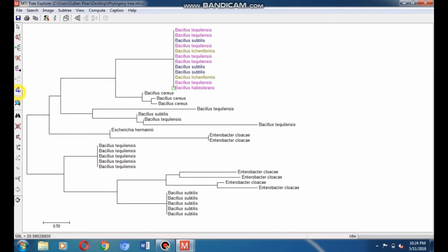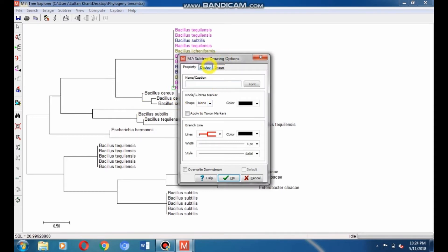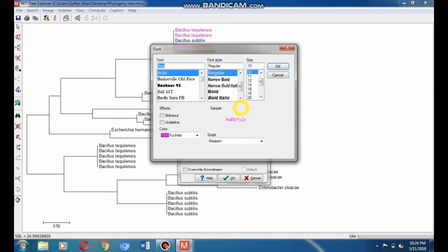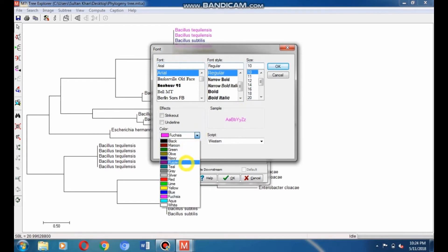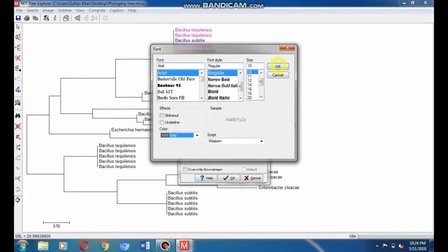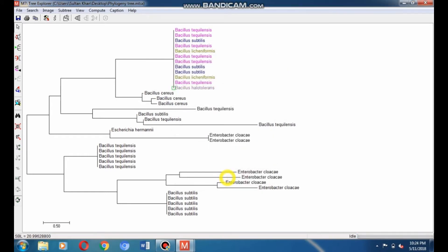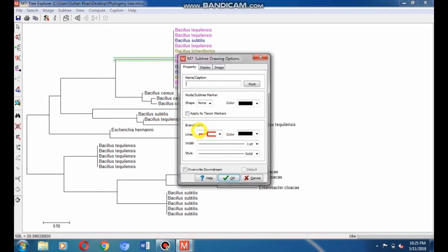Select the Bacillus halotolerance species and give it gray color by going to Font and choosing gray color, then click OK to apply it. You can also change the color of the branch line. Select the branch of the halotolerant species by single-clicking on its branch, then go to subtree drawing option and select the branch line. Go to Font option and select your desired font color — I give fuchsia color to the halotolerant species branch to make its clade colorful.